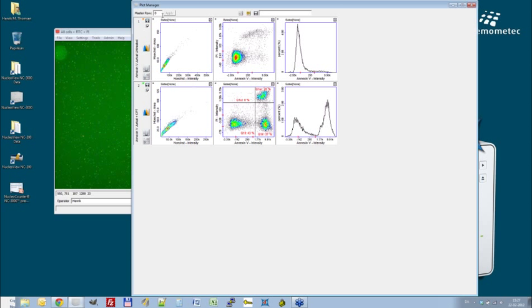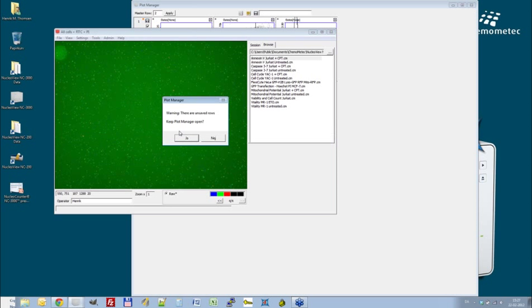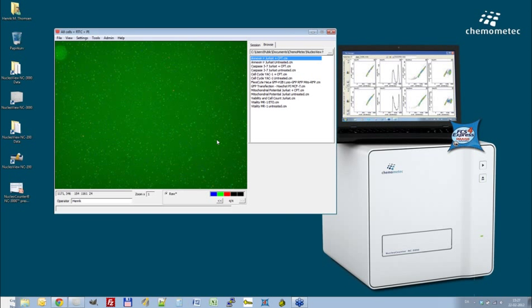And again, if we want to have the same gating on the upper row, we can this time put row number 2 as a master, and we can see it's drifted from 91% of live healthy cells to 43% of live healthy cells. And the Annexin 5 positive early apoptotic cells are drifted from around 2% to 37%. So the camptothecin treatment of these cells introduced very much apoptosis. And here it states that if we have any unsaved rows we want to save, we could do that, otherwise we could quit the plot manager.